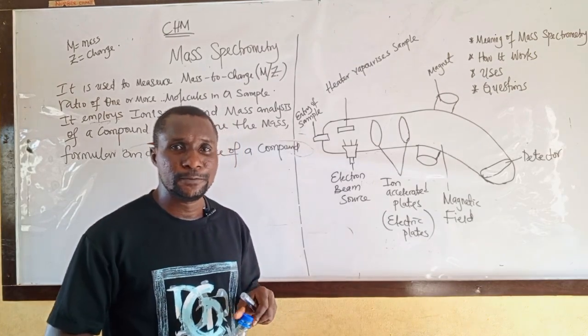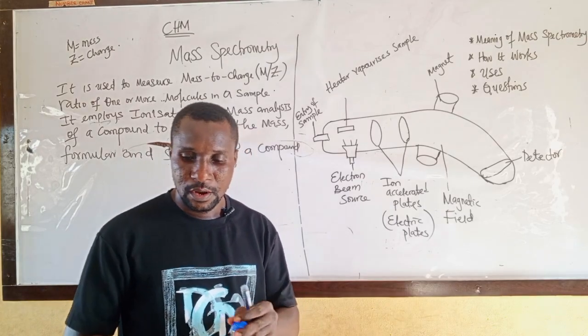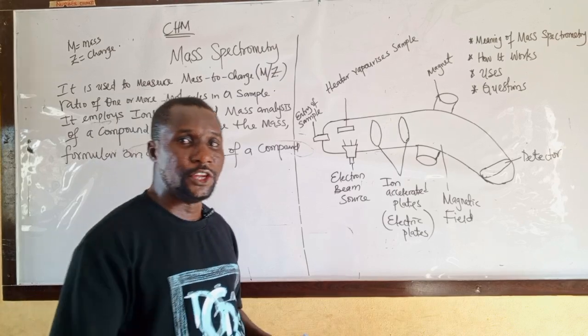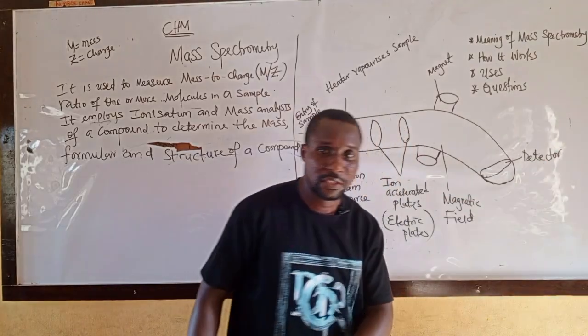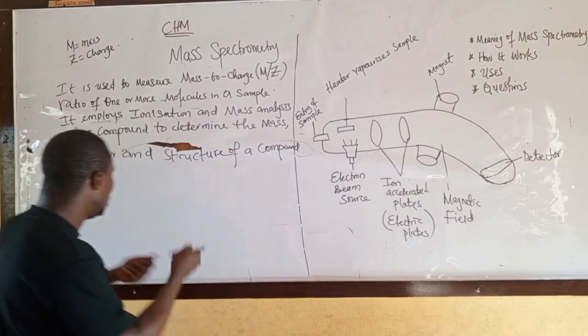The second stage, I will call the accelerator stage. The third stage, I will call the deflector stage. While the fourth stage, I will call the detector stage.